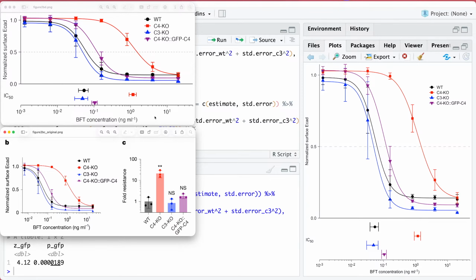But this is going on long enough, and I am sorry for going on so long, but thank you very much. And so Mark, your comment about method equals LM, SE equals true. Yes, that will work for linear model, but not for NLS.